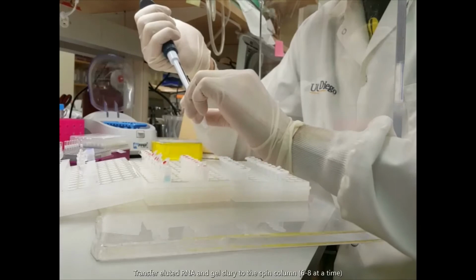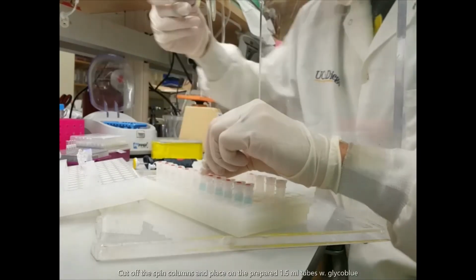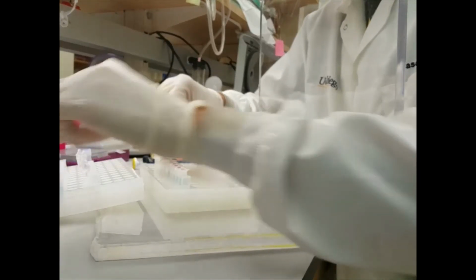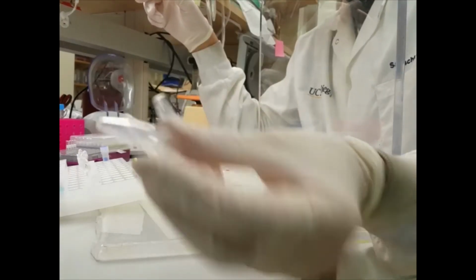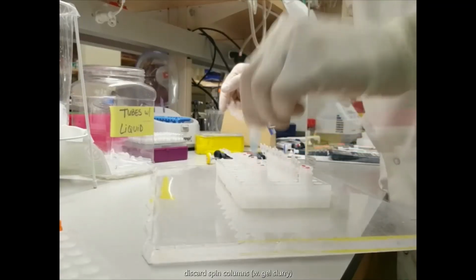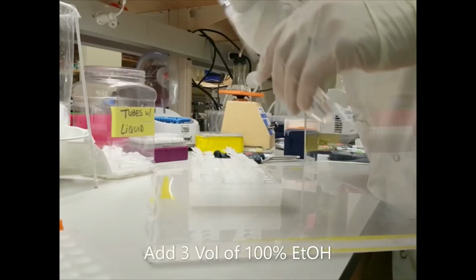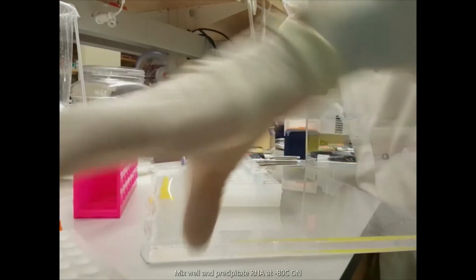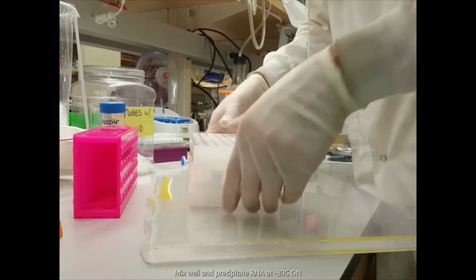Every 5 or 6 transfers, I would recommend to cut off the tops of the column and transfer them into the 1.5 milliliter tubes that contain the GlycoBlue. Once all samples and spin columns are transferred, spin the samples at 1000 g for 1 minute to separate the gel slurry from the eluted RNA. Discard the spin columns and then add 3 volumes of 100% ethanol. Close the tube, mix the sample well, and precipitate the RNA in a -80 freezer overnight.